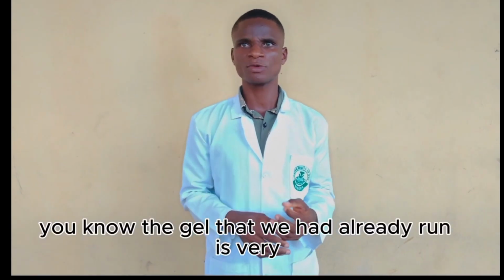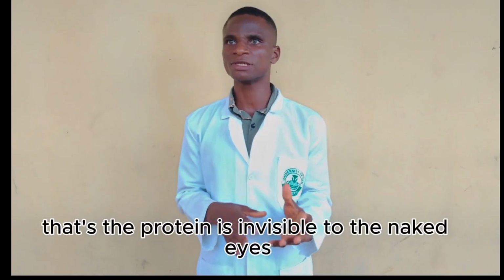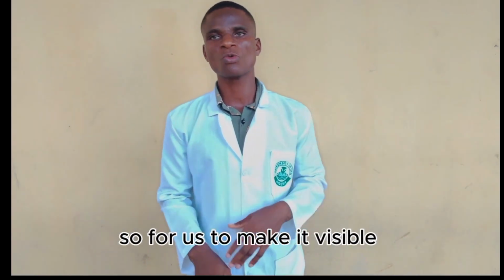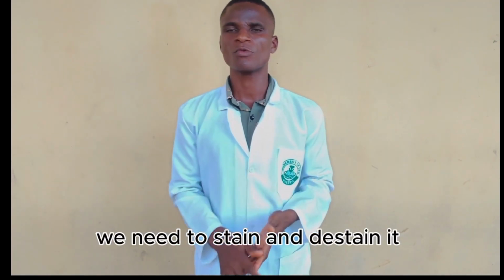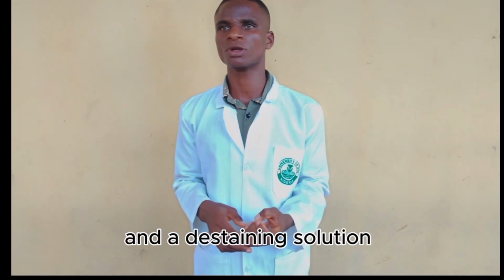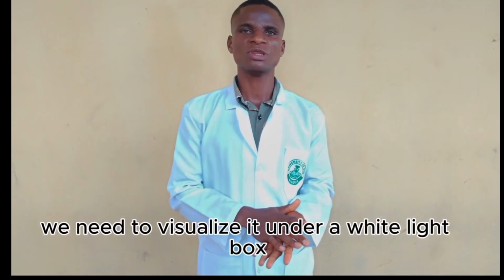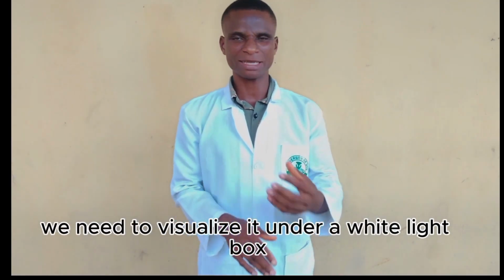After we are done with that step, we now move on to stain and visualize. The gel that we have already run is invisible, that's the proteins are invisible to the naked eye. So for us to make them visible, we need to stain and destain it using a proper staining solution and a destaining solution. After we have stained and destained it, we need to visualize it under a white light box.